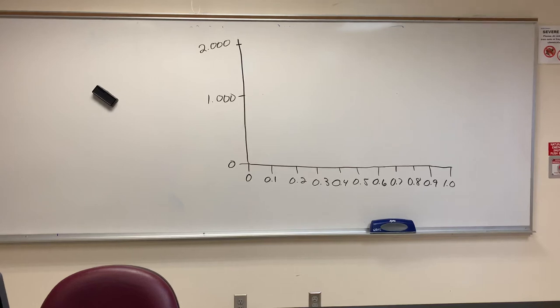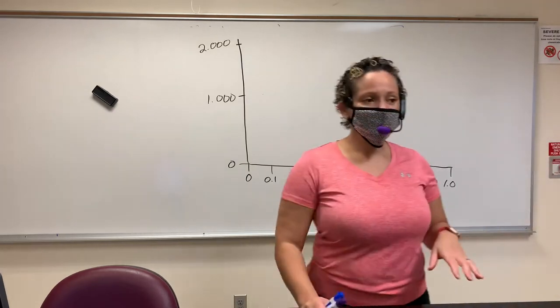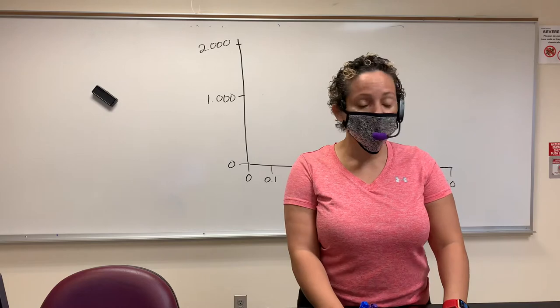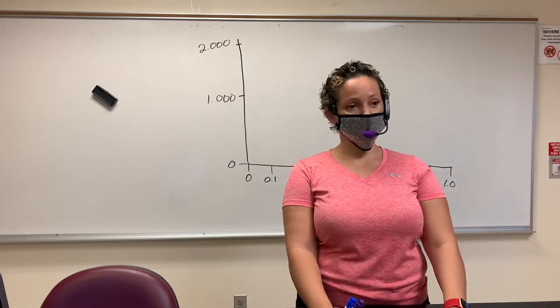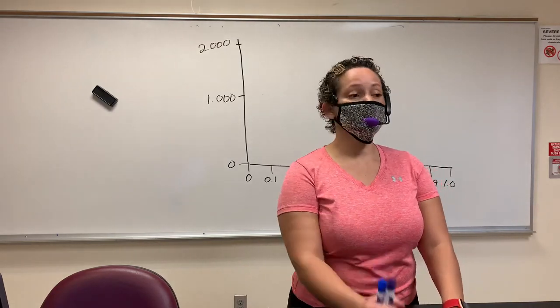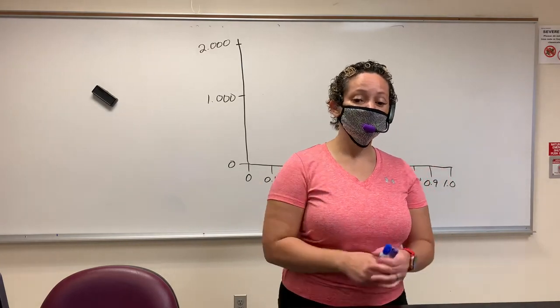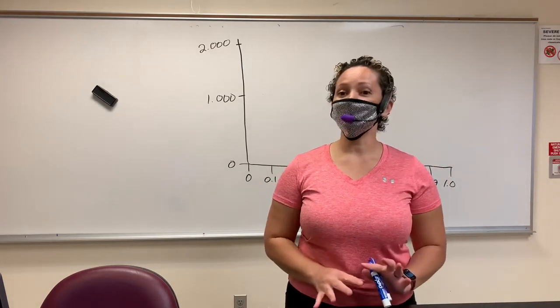There we go. So how do we report our results? Graphs are so important. You are going to find that even though you guys are online, I expect quality graphs, okay? As you're doing your quality graphs, number one, you are not allowed to do computer graphs. They have to be handwritten.